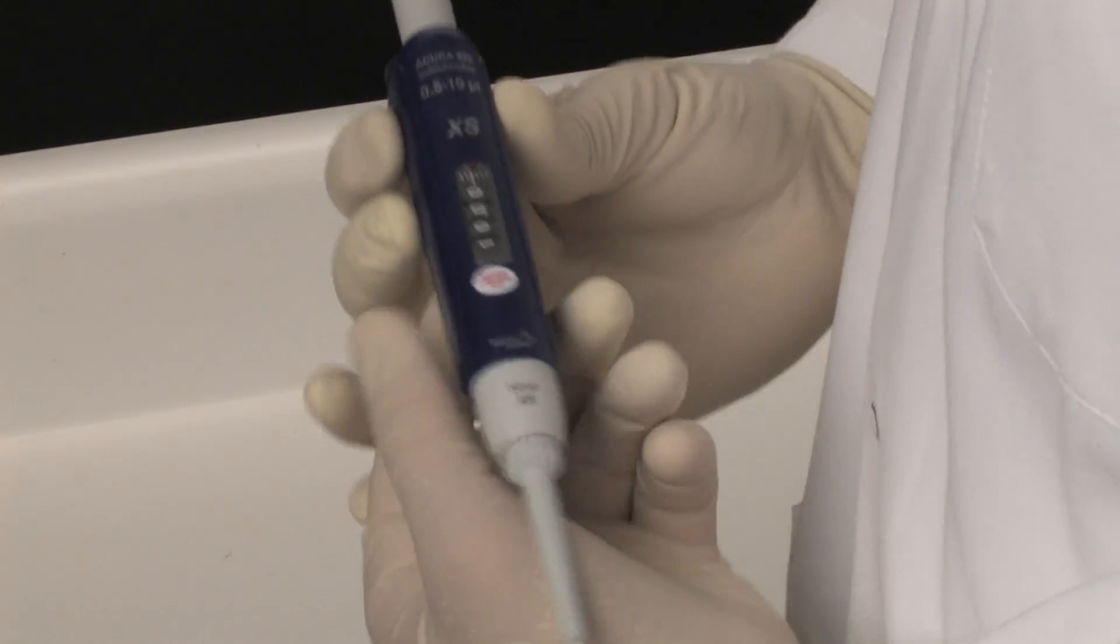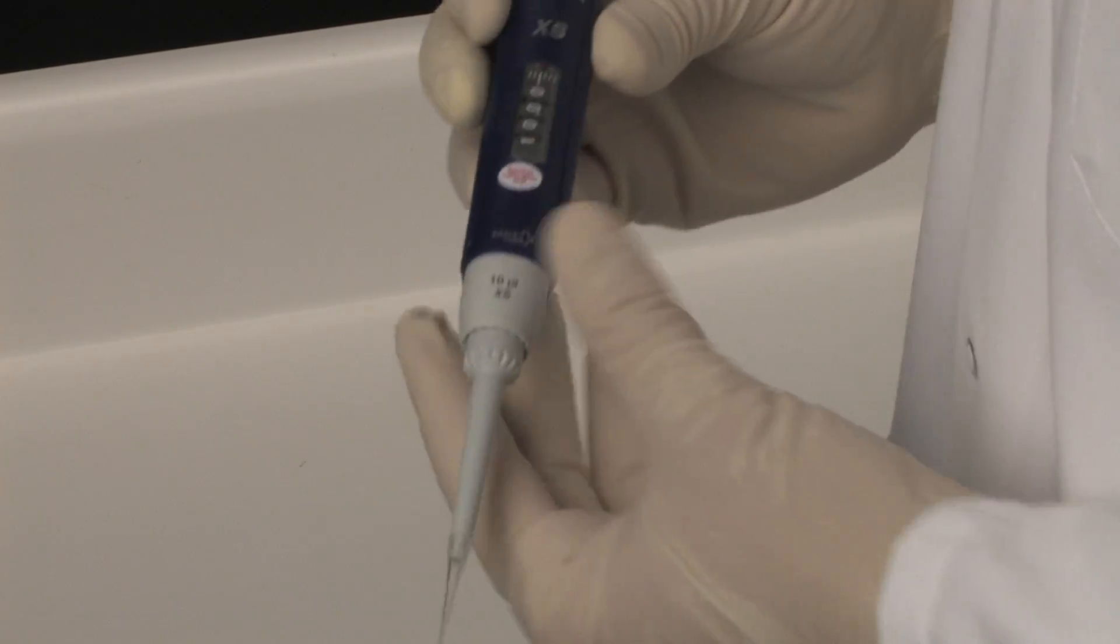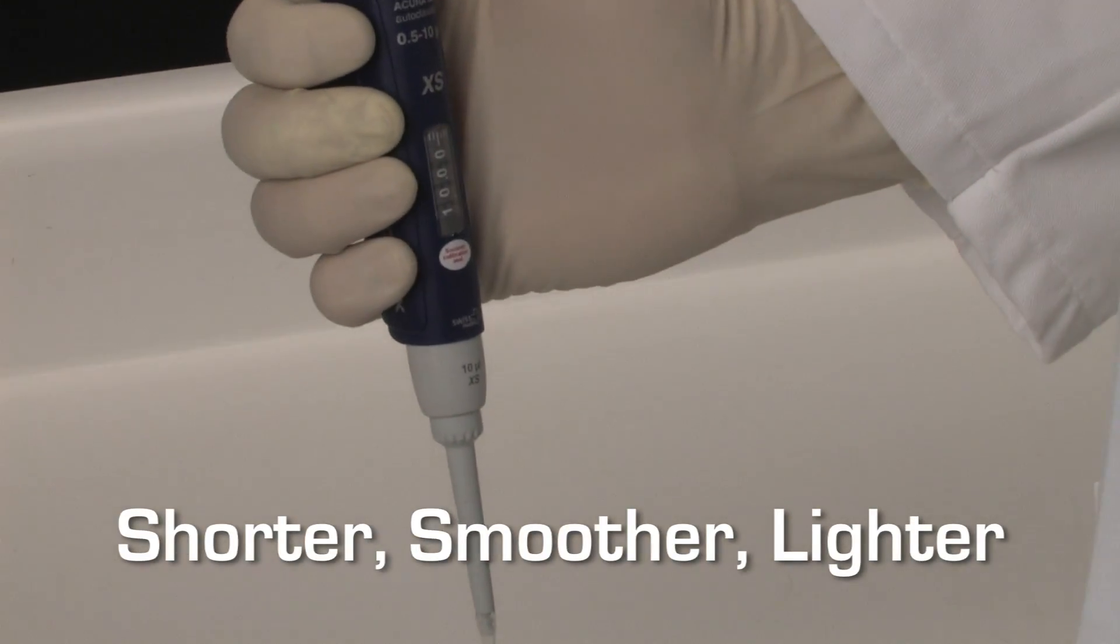including precise setting and checking volumes, as well as user-friendly tip adjustment to accommodate a variety of tips, the 826XS is shorter, smoother, and lighter.